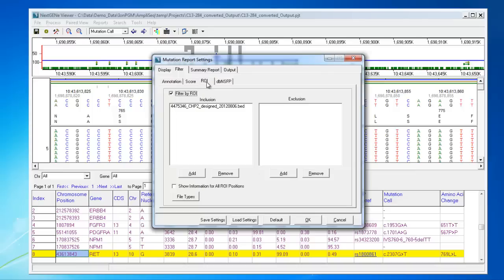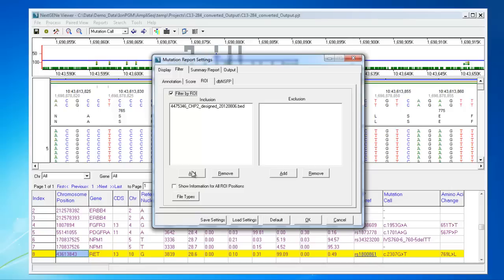On the ROI tab, you can load a BED file to filter out any variants that are outside of your regions of interest. This is an important feature for the Hotspot Cancer Panel data. So you can select to filter by ROI, and then you would click Add to browse and load your BED file for your target regions.